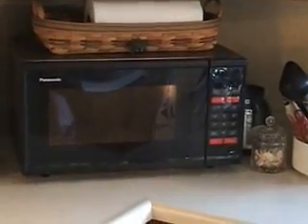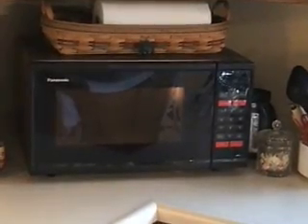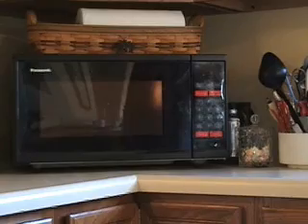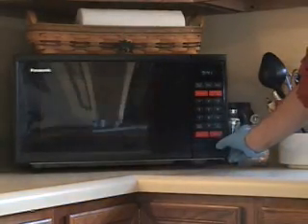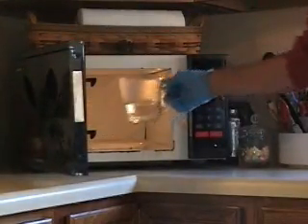Okay, I am currently microwaving my water so that it will boil, and that's what you're going to be needing, and I'll show you that. Currently we have boiling water.